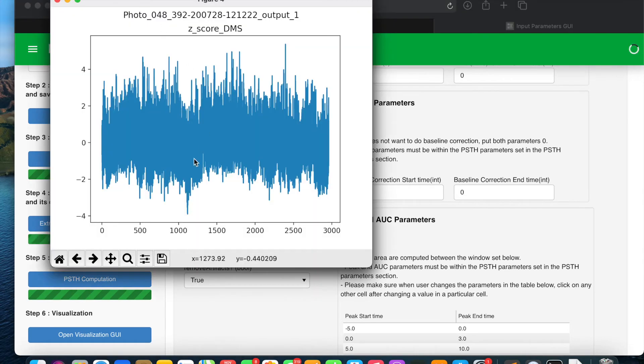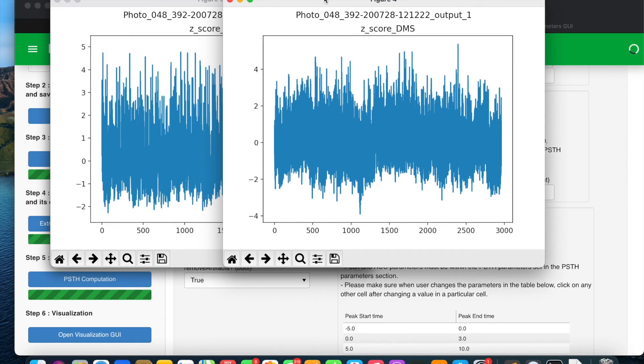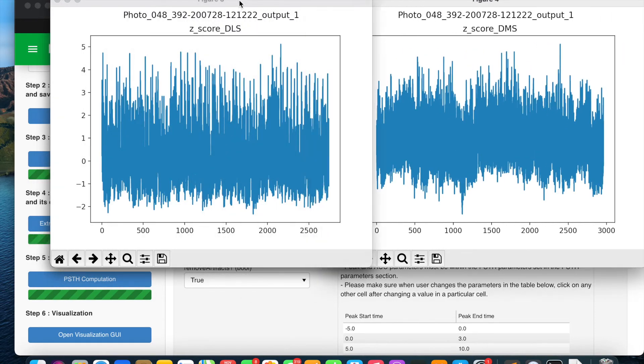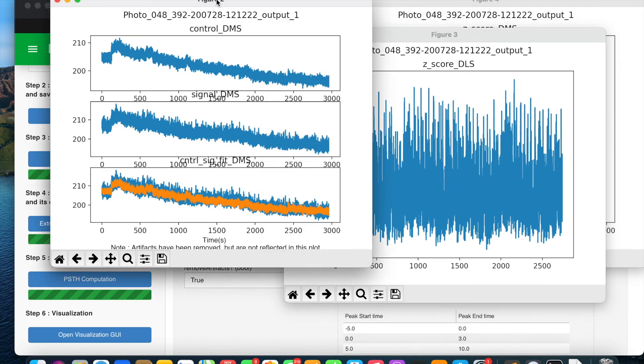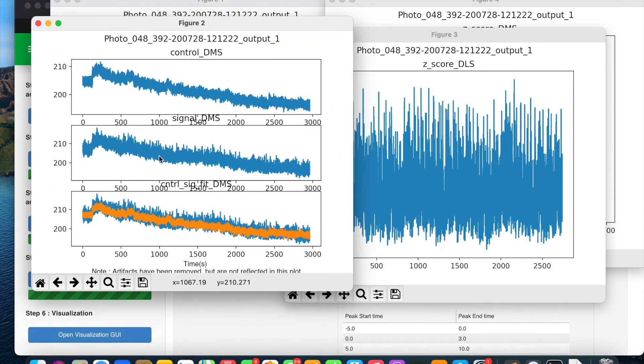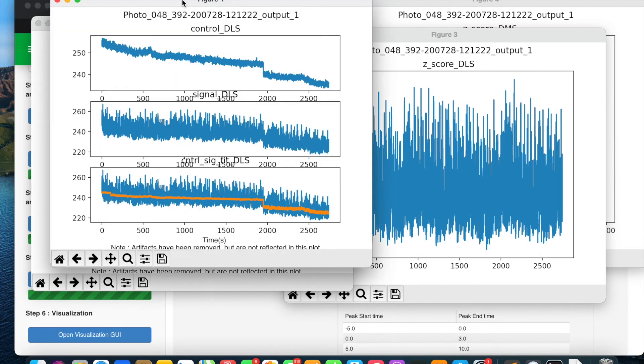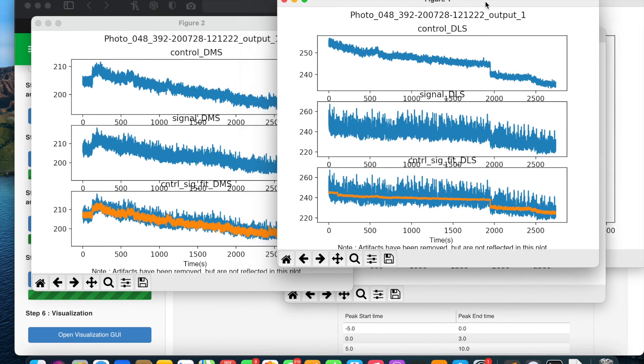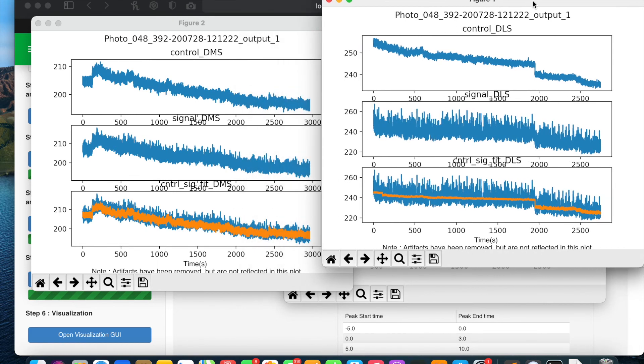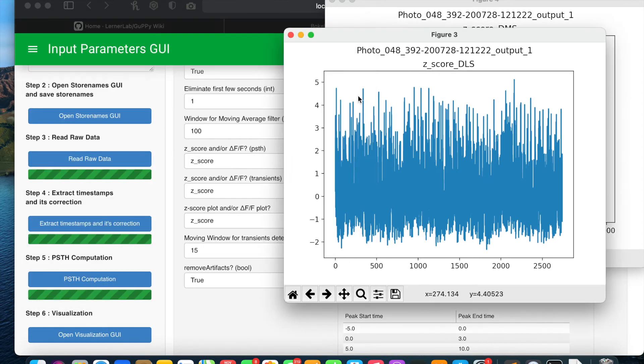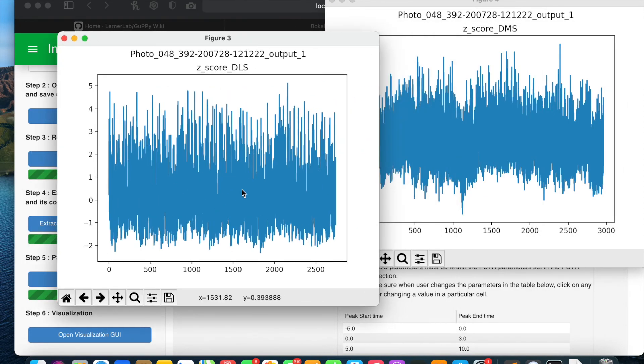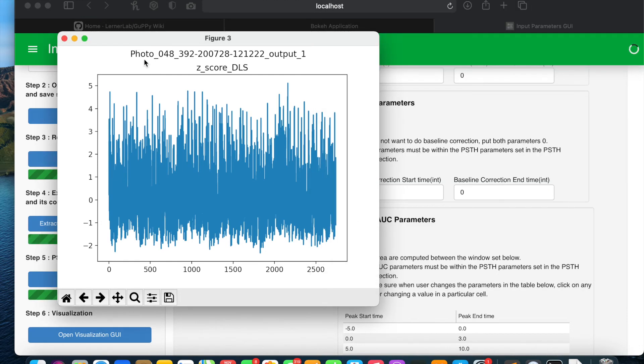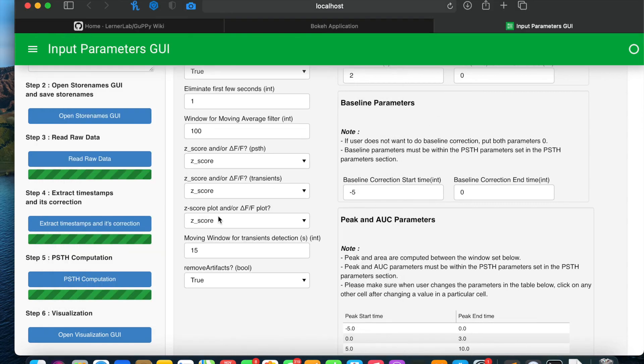Now as we have selected the z-score plot, you will see the z-score plots. At the same time you will see the removal of artifacts in figure 1 and figure 2. All the chunks we selected are just concatenated and being plotted. But if you see the z-score you will see that it looks good after the artifact removal. I will close this window and move to step 5 which is PSTH computation.